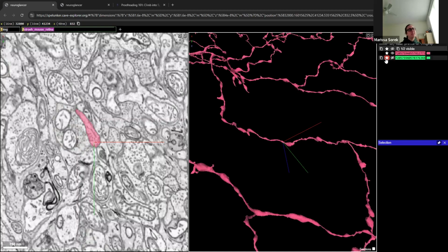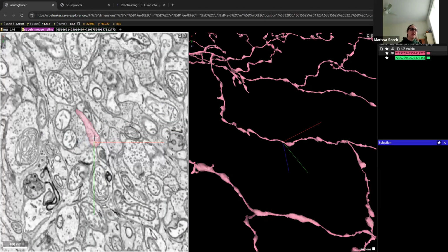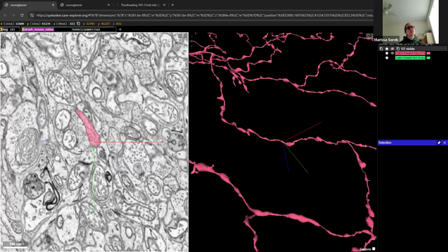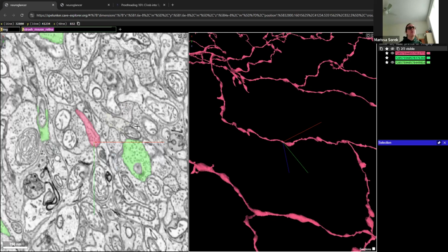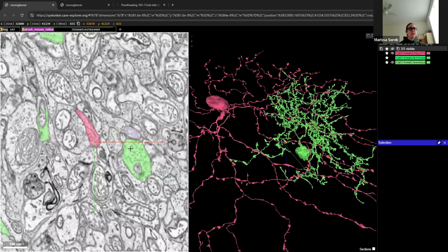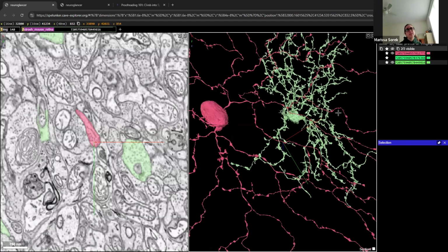Something to note, and once again, I forgot to grab an example of this, but I'll talk about the segment IDs in a minute and how we can get the most recent up-to-date version of the segment ID. So each segmentation here, each thing that's been put into our EM, is related to a segment ID. They are made up of many little supervoxels, all the supervoxels connected together to create our segment. And that creates our full cells.